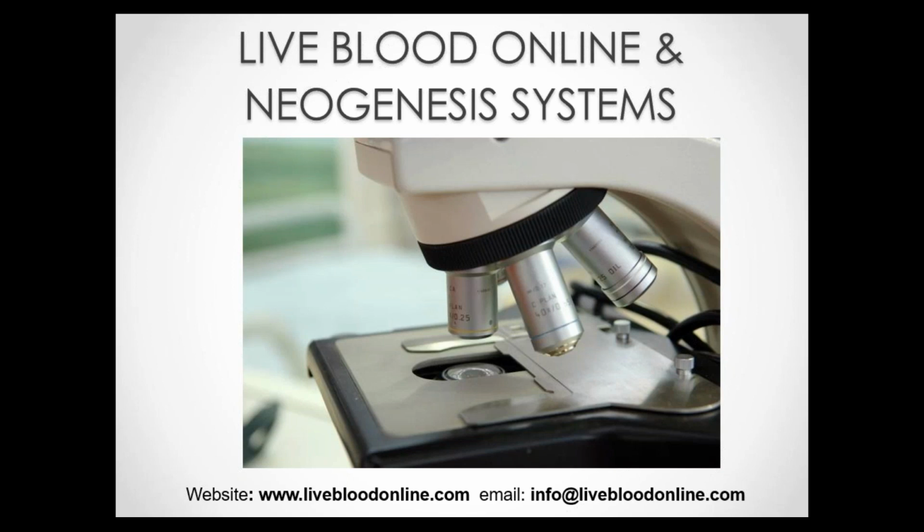Thank you. And we have a question that comes up quite often. How reliable is live blood analysis? And how much variation is there in the findings in a patient's blood from one day to the next? Yeah, no, look, there are some practitioners who are skeptical of live blood analysis, and I mentioned this is one of the potential problems with the test, that there are many factors that will affect the outcome of a live blood test, which may then mean that a patient's results will vary dramatically from one day to the next, based on what they had to eat, when they ate, and how much water they drank, for example.